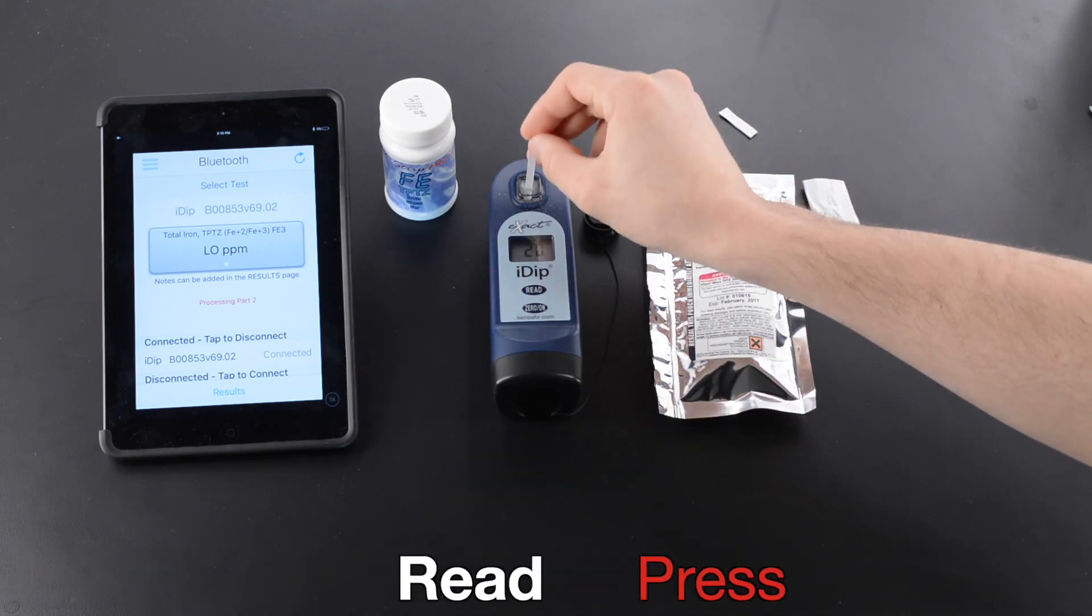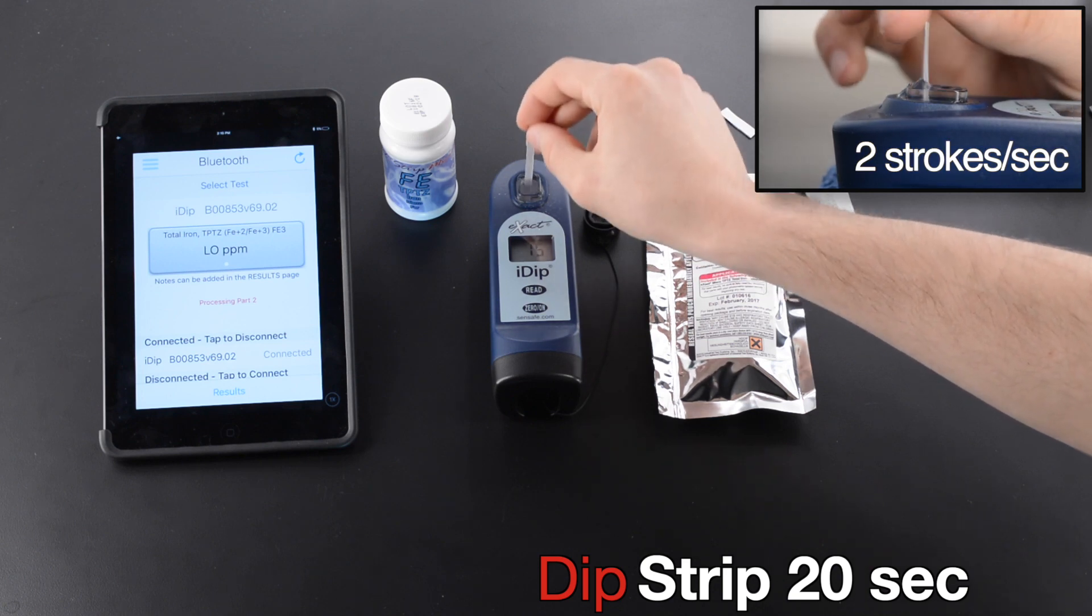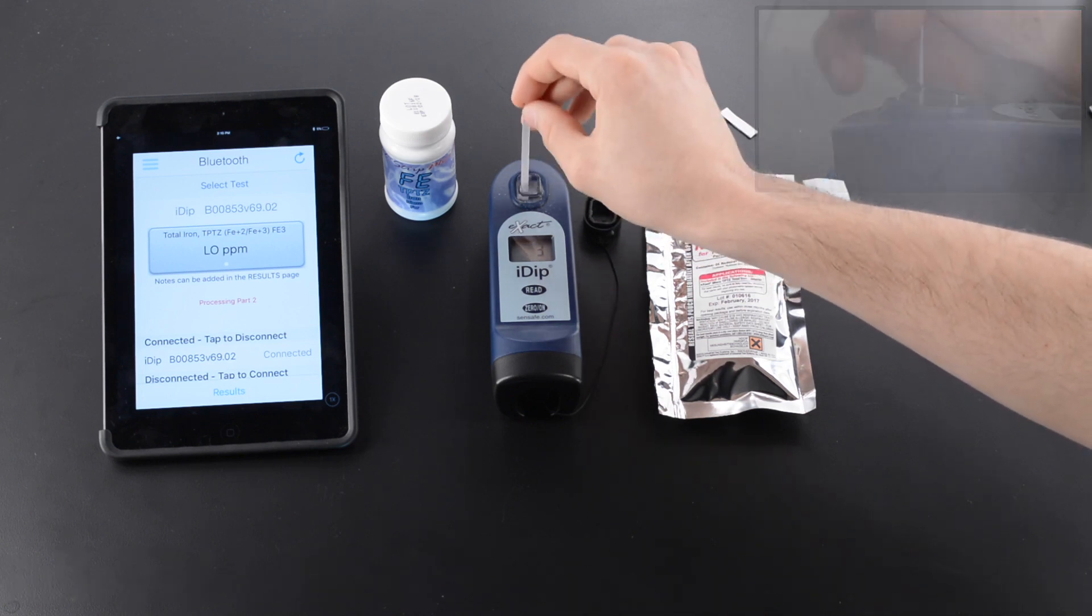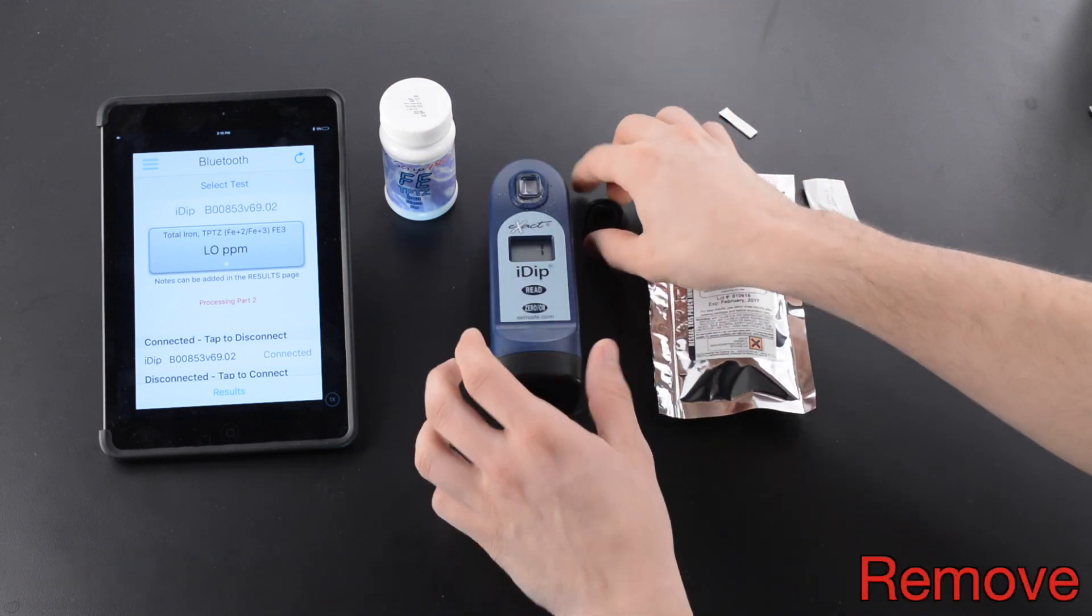Press Read. Dip Strip 20 seconds. Two Strokes Per Second. Remove Strip at one second. Replace Cap.